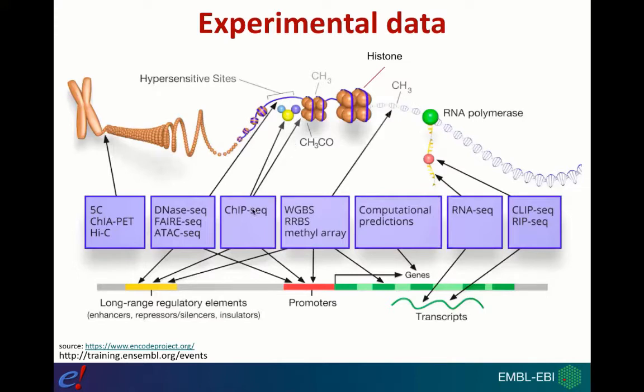But we can also use ChIP-seq to interrogate the different histone modifications across the different regions of the genome. We can use antibodies in our ChIP-seq experiment that bind specifically to histones that are modified in a particular way, and follow that with sequencing to find the type of histone modification that we observe in a given part of the genome.